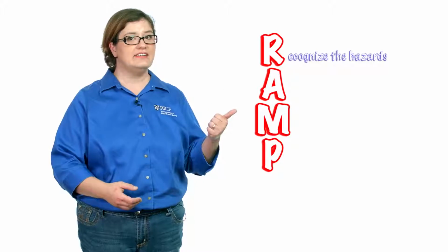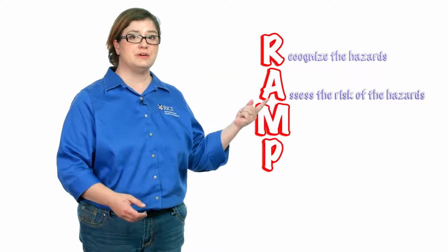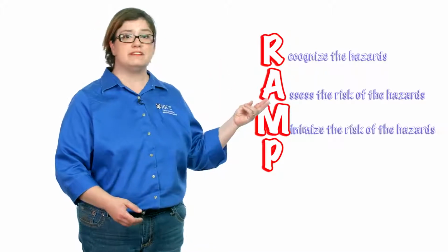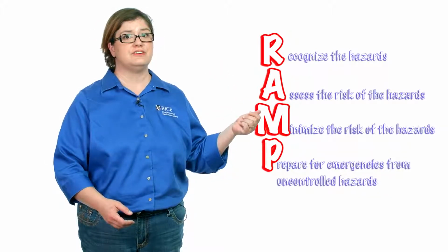There will always be risks associated with doing laboratory research. However, we want to minimize those risks as much as possible. One way we can do that is by using the RAMP method. RAMP is a convenient acronym that stands for recognizing the hazards, assessing the risks associated with those hazards, minimizing the risks, and preparing for emergencies from uncontrolled hazards.